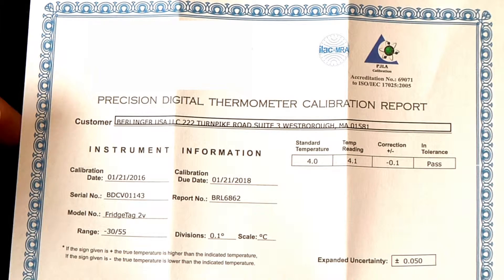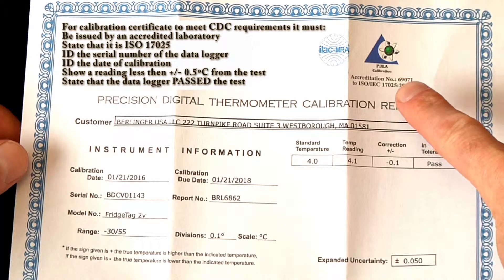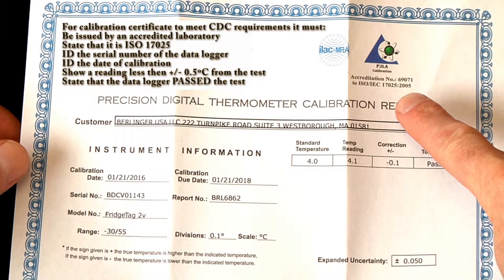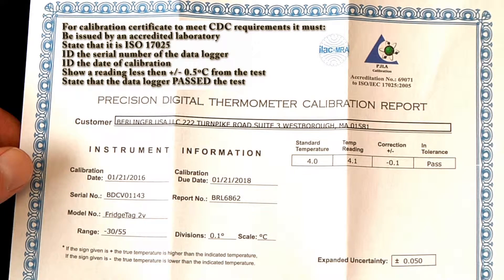In this video we will explain how to ensure your calibration certificate is CDC compliant. It must come from an accredited laboratory, it must be ISO 17025 certified, and it must also list the individual serial number of your data logger.